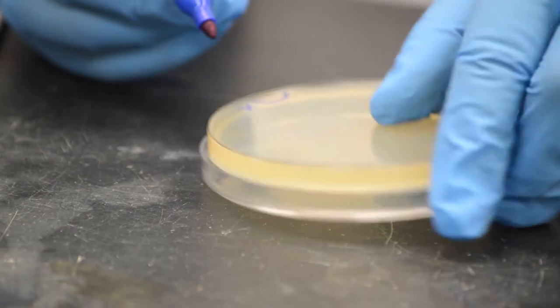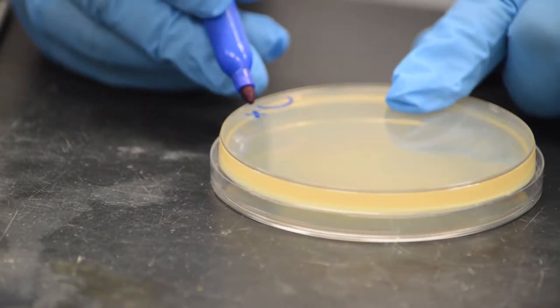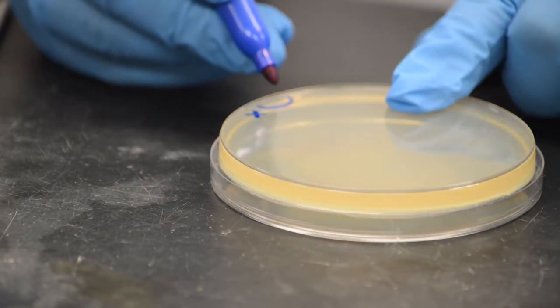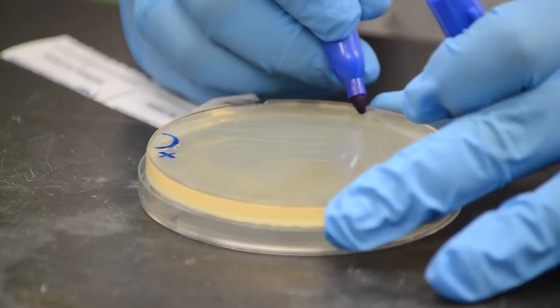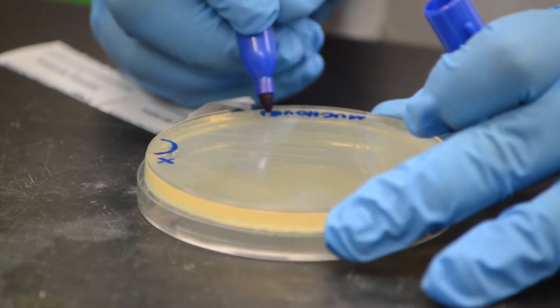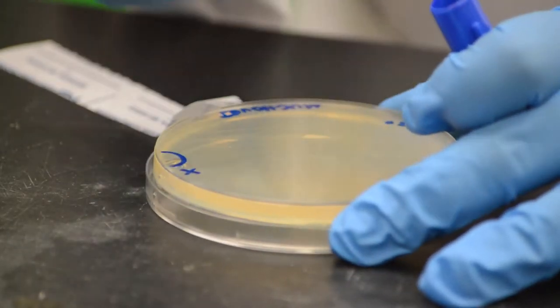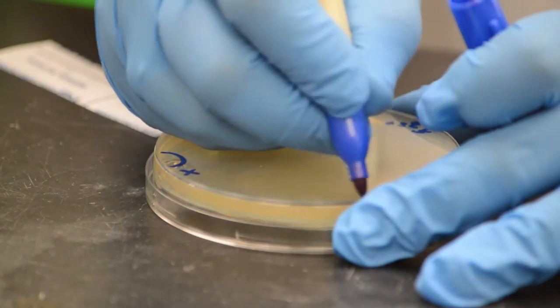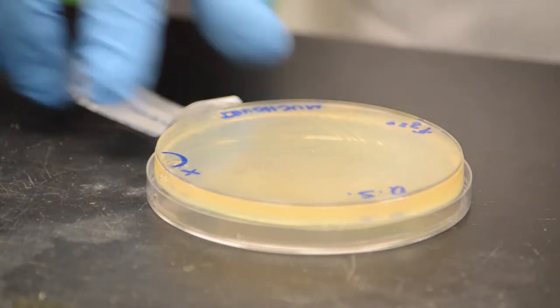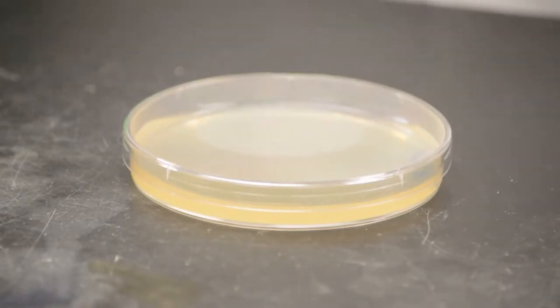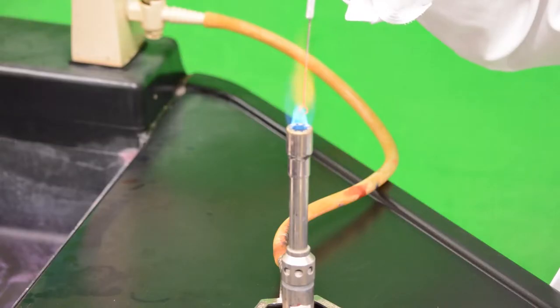First, label the petri plate provided by marking the bottom of the plate with an X to indicate the place where you want to start your set of streaks. Also label information such as the date, your name or initials, your lab section, and source of bacteria being used. Place the petri plate topside up on the table.